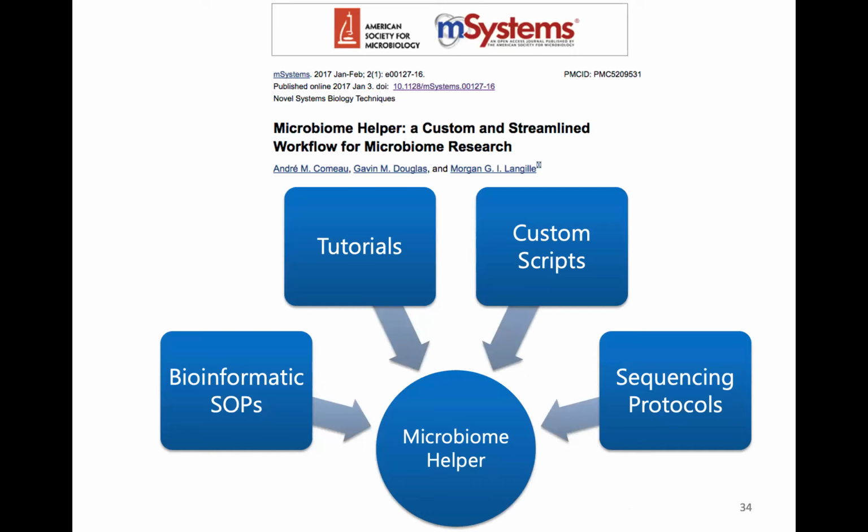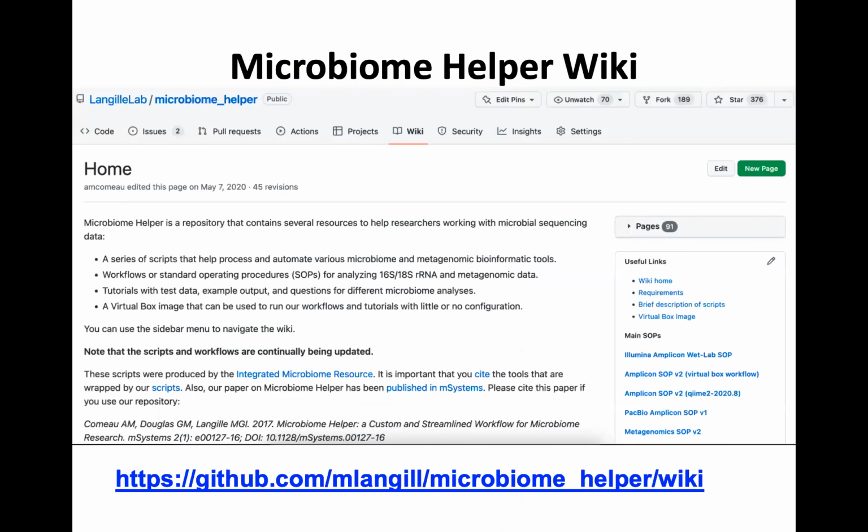And then the last thing I just want to mention, because this will play into the lab, is that we'll be running through a tutorial. I mentioned Microbiome Helper. It's essentially a set of bioinformatic standard operating protocols. So we have one for 16S. We have tutorials as well. We have some custom scripts there, and we actually have sequencing protocols as well. So it's a pretty good resource that you can check out. There's essentially a wiki there, and on the right-hand side, you'll see links to these protocols. I don't want you to just copy and paste commands, but the commands are there with all the options, so you can follow those, and that's what we use in our lab. So when there's an SOP, that's essentially what we're using currently within our lab.